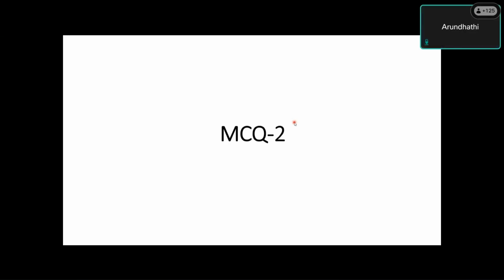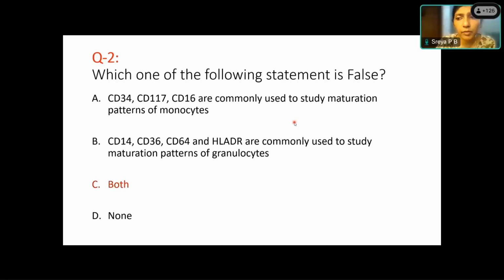Okay. If gating is done based on a normal bone marrow sample, can it vary based on population type due to different genetic makeup?